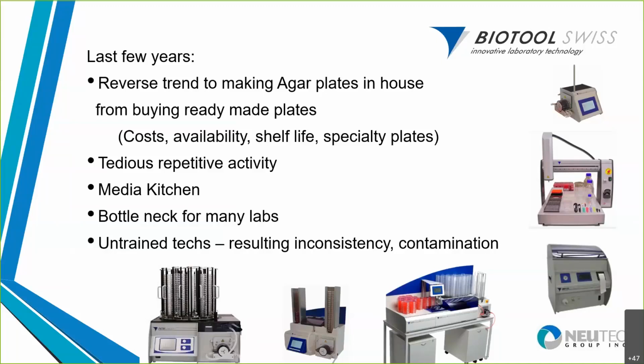And so this idea of bringing it in-house does present some problems as well, because when you bring that in-house, the process of filling these petri dishes can become tedious. It's a repetitive activity, and whenever that happens, there's always a chance for mistakes as you start to do things over and over again and lose focus. Creating these media kitchens manually can become a bottleneck for the labs, where you're waiting for media because it's such a tedious and long process.